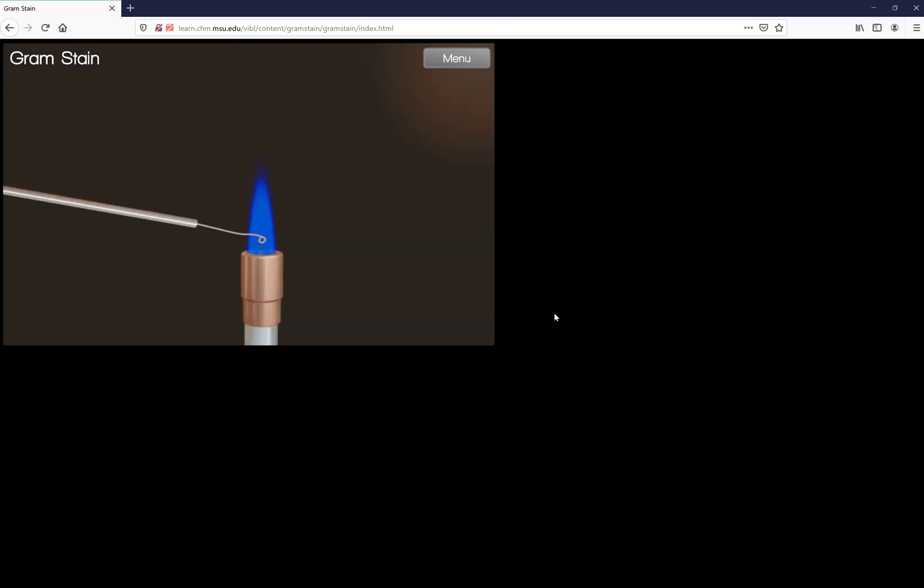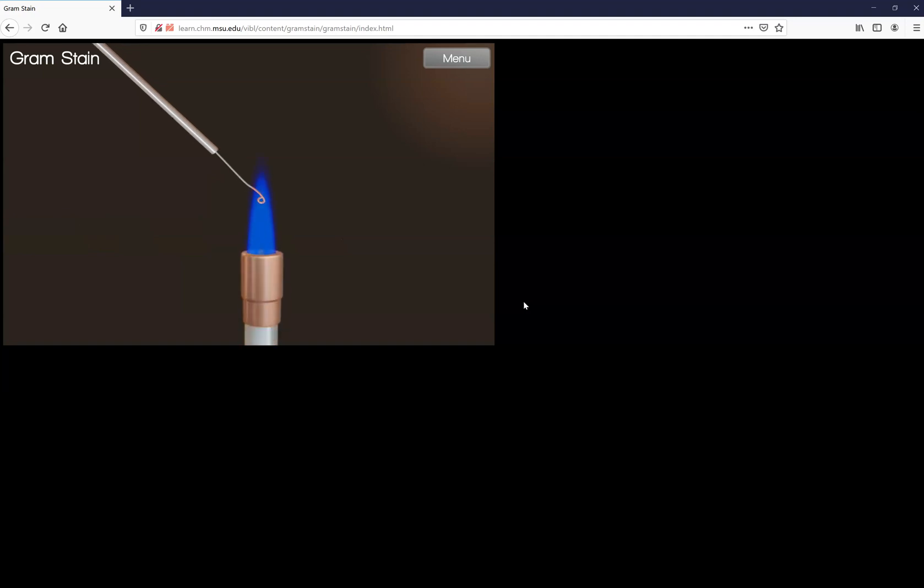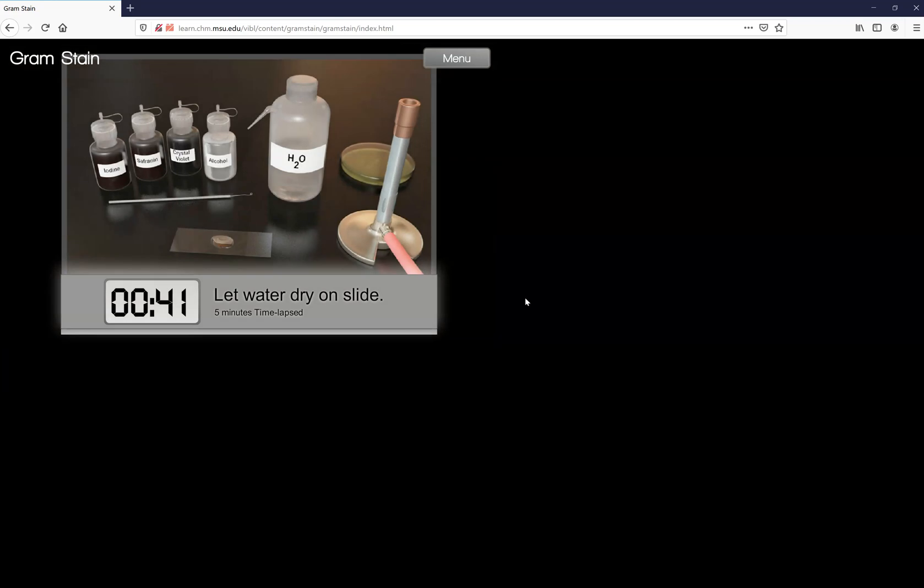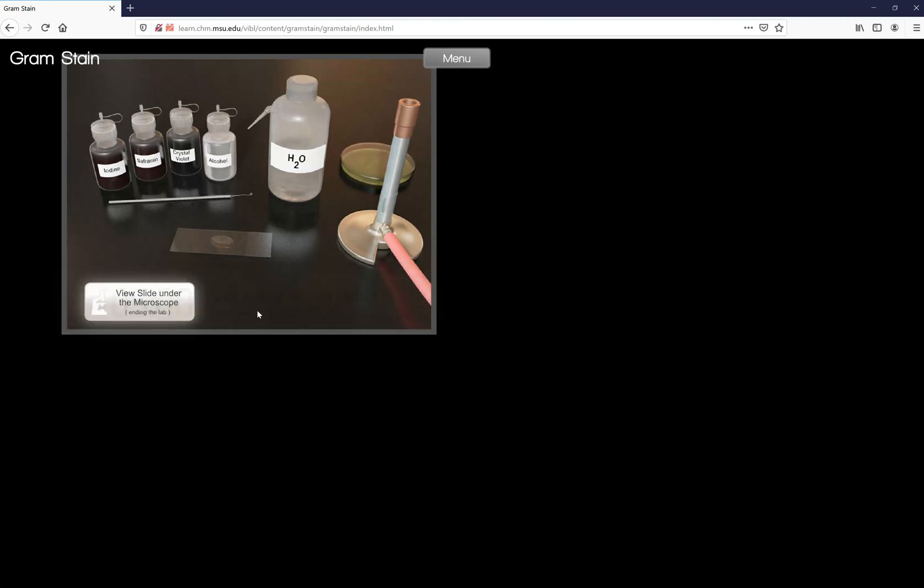So it automatically starts by flaming your loop for you. That kills anything that would have been on the loop. It goes ahead and dips in and gets some of your bacteria from your tube. It wiggles it around and swishes around in a water drop. After you let the water and the bacteria dry on the slide, it automatically will go through five minutes for you real fast.